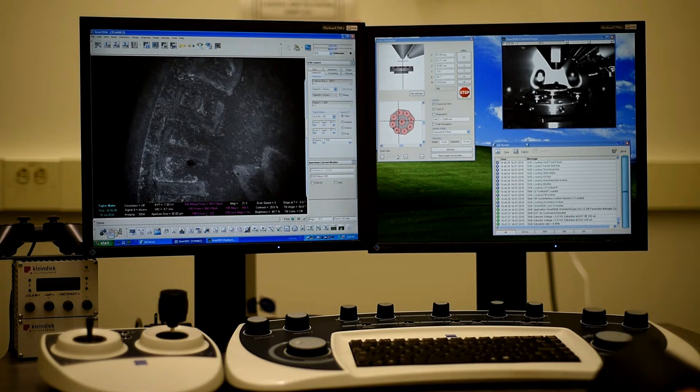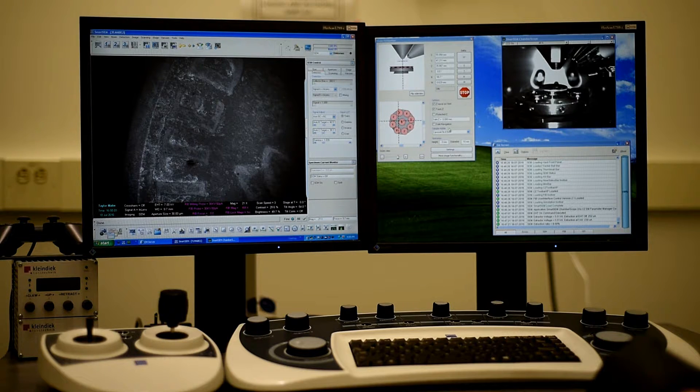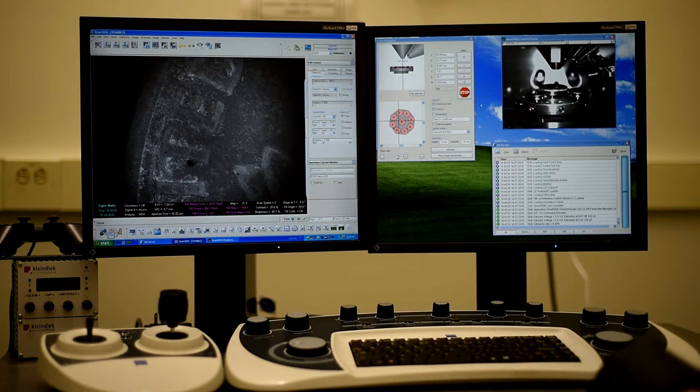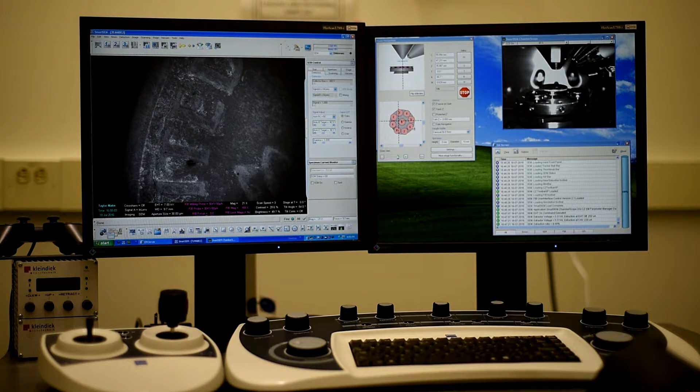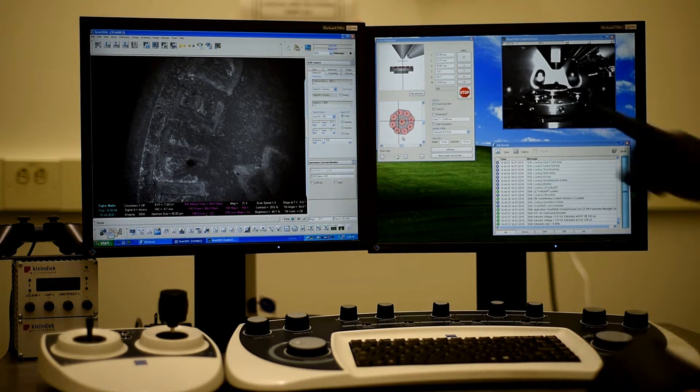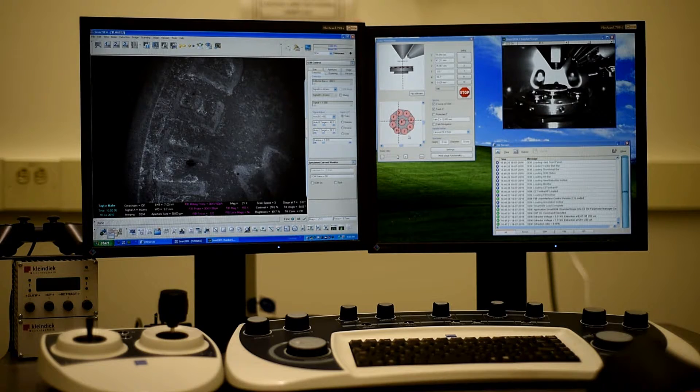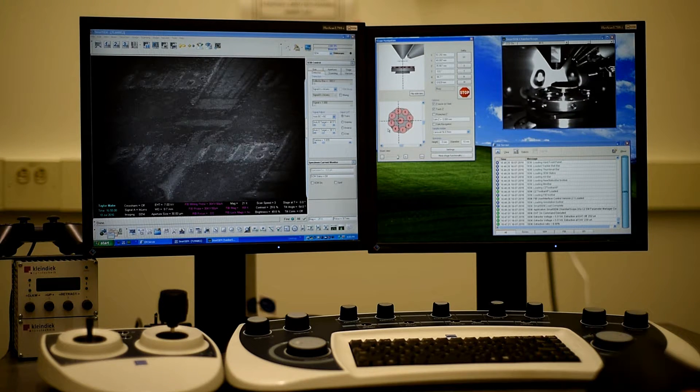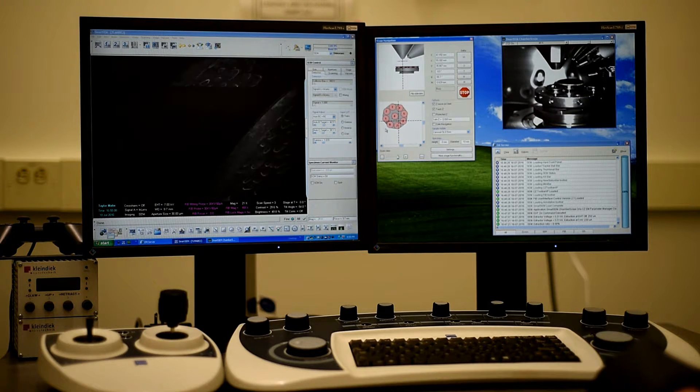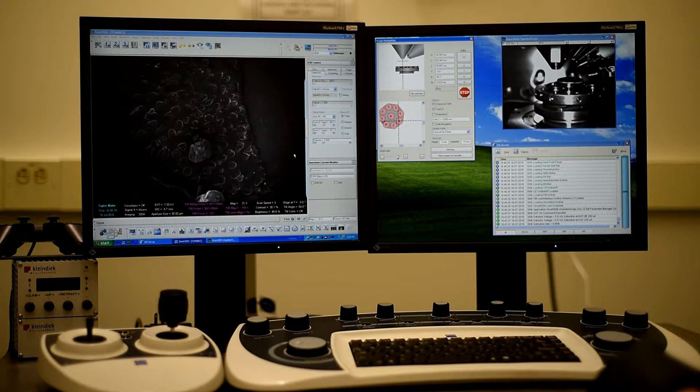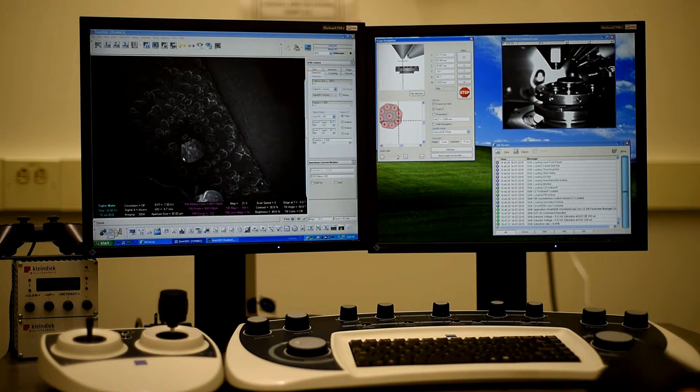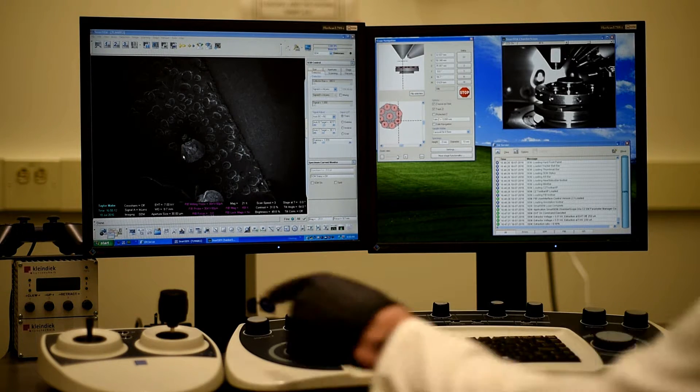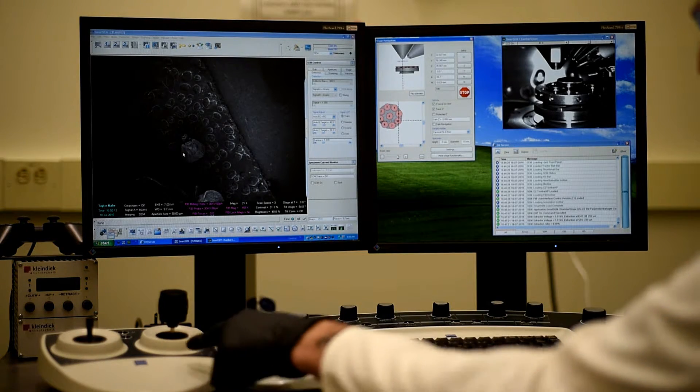I've also loaded some fruit flies, which I sputter-coated, I believe, in position 6. So if we go to the stage navigation screen, I can click 6. Then we'll click that. And it will move to the fruit flies. You can see those there.